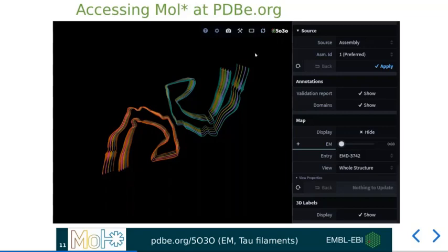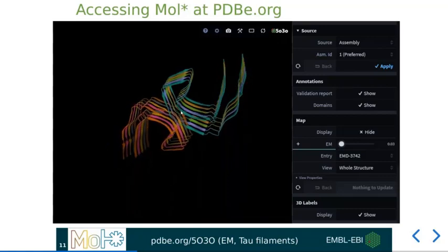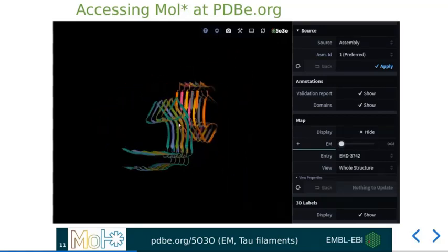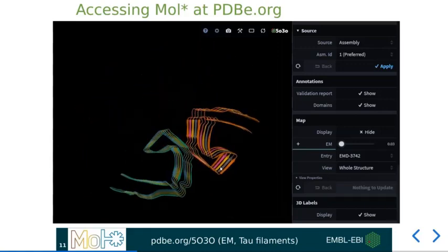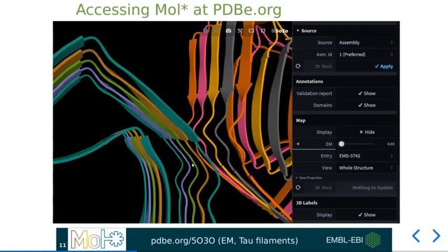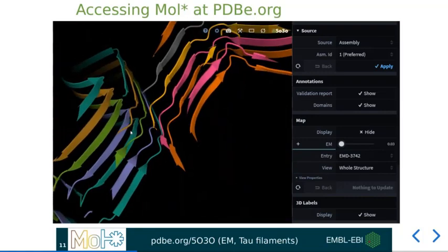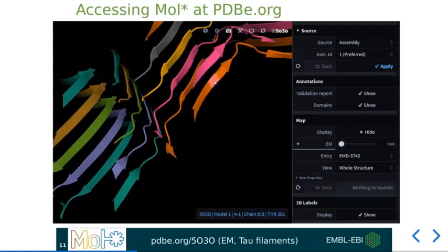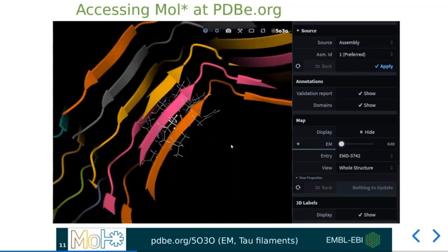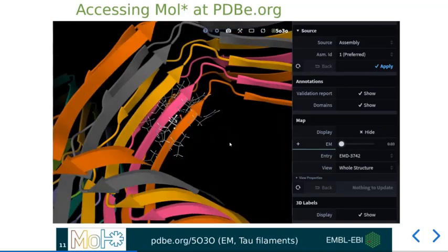Now the controls I previously mentioned work here, and hopefully you can see the speed at which I can easily move around the structure, whether it be by rotating, translating, moving around the structure, zooming in, and then when clicking on a specific area of the protein, I can also hold shift and scroll and change the slabbing as well.